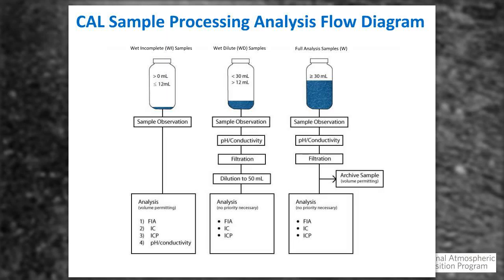There's been times Brian and I wanted to cry because we've seen sample volume, and there'll be a note on the field form that says, too little sample to ship, so it was discarded, and we'll look, and it was 20 or 30 mils. And I said, well, we could get a full analysis on this. So it's really a wasted week of effort on your part not to ship that to us.